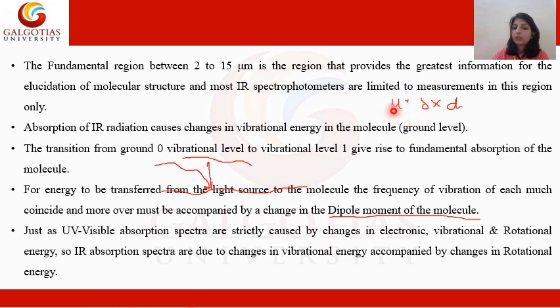So whenever a molecule has an electronegativity difference, it will develop a particular charge, so we get a particular value of dipole. Now suppose that molecule vibrates; we can assume it like a spring attached to two balls. Whenever you stretch or bend this spring, the bond length or bond angle will change, so the distance changes. If we stretch a molecule, the distance increases. If we bend a molecule, the angle changes. So in both cases we experience a change in the dipole moment.